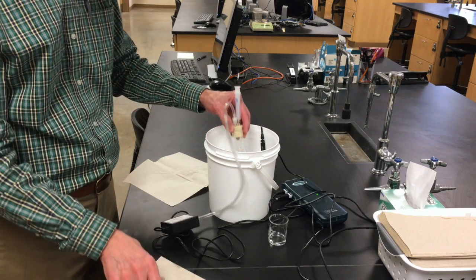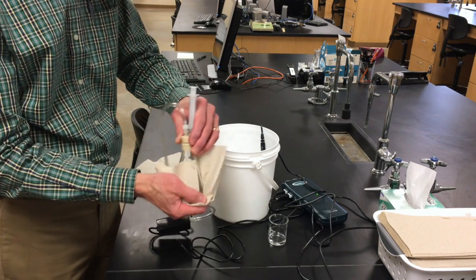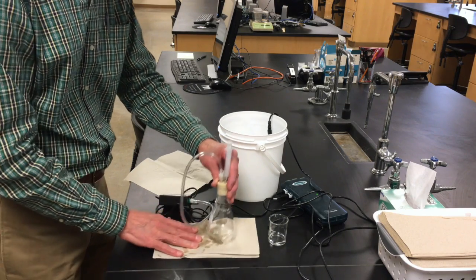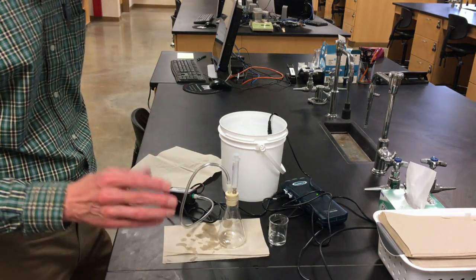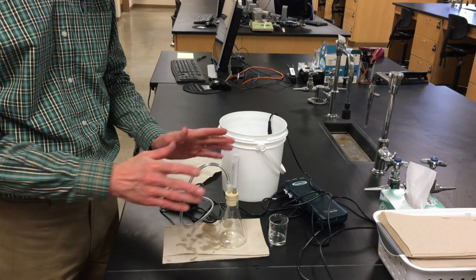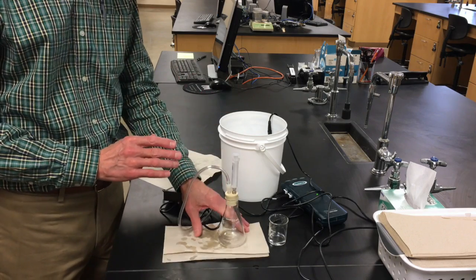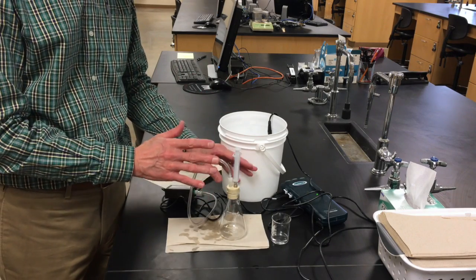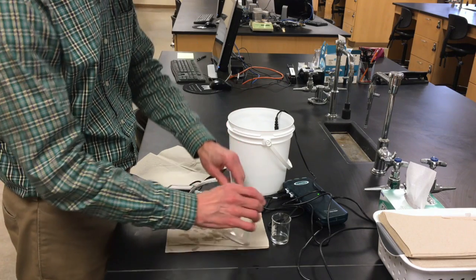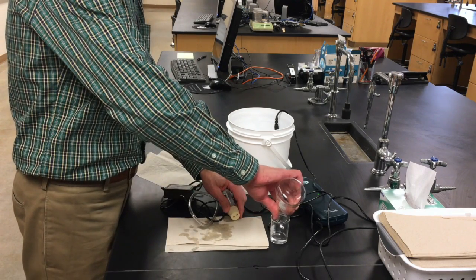All right, now if we're done with this liquid, this is ethanol, we're ready to move on to the next liquid. As I mentioned, the thing we have to avoid is cross-contamination. We have to get rid of all the liquid in this system. All the ethanol has to be gone. So let's start by just taking this apart and pouring out the few mils.